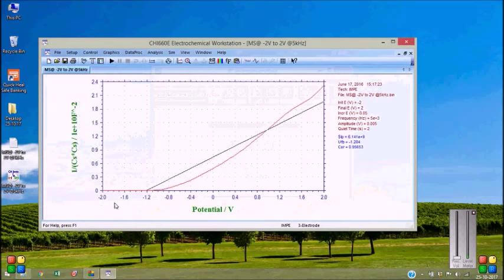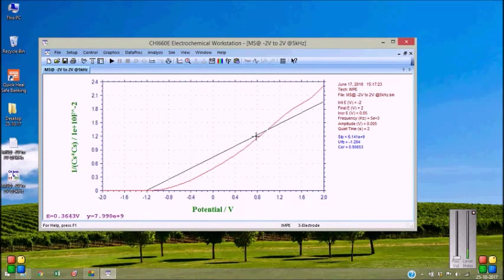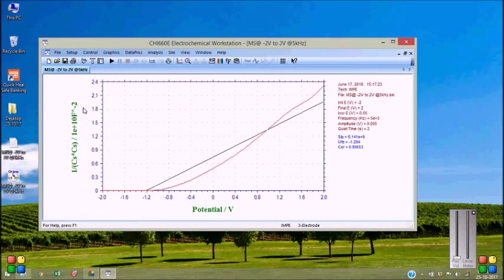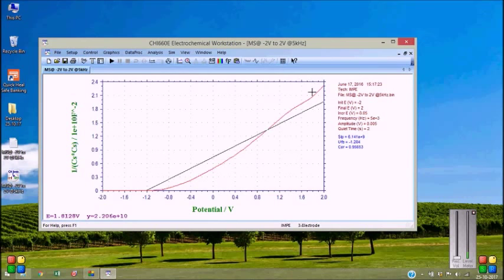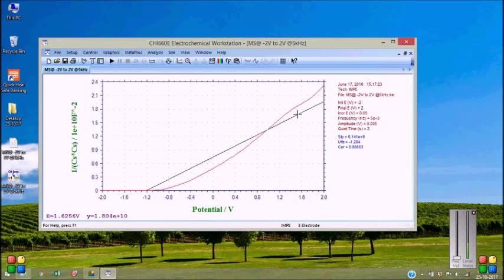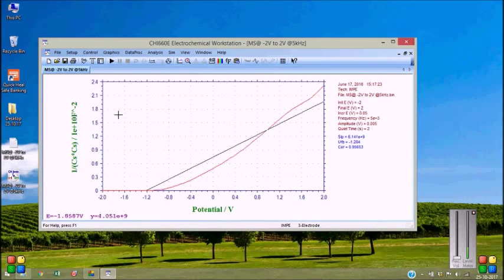You can see the Mott-Schottky plot here. This is one by Cs square versus potential plot, the Mott-Schottky plot. And I want to get this plot in Origin or Excel. So let's begin.